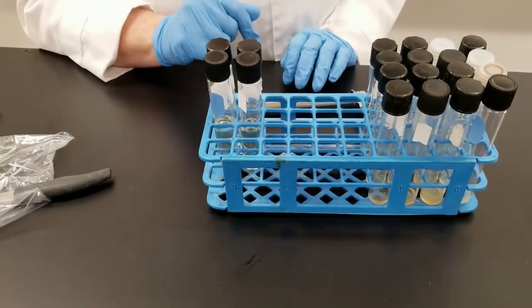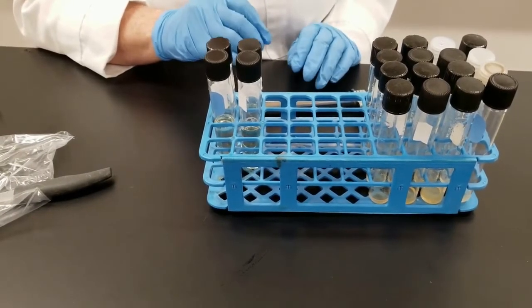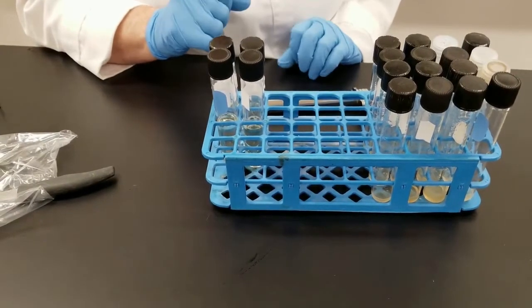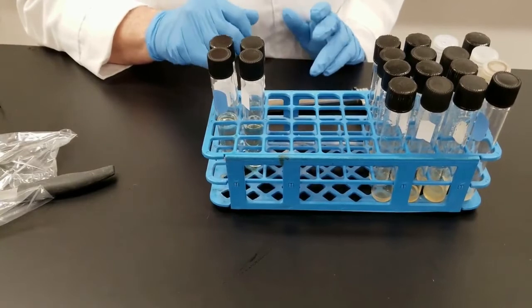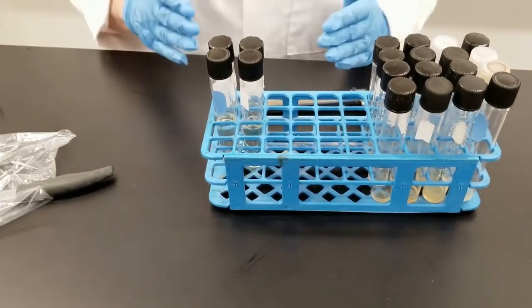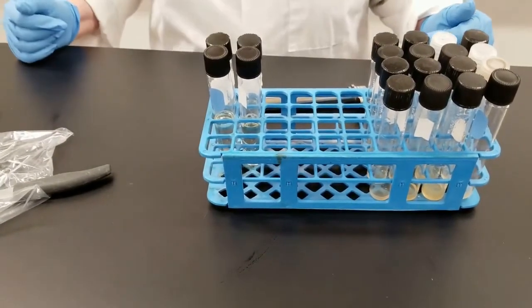They prefer media in a pH range from about 5.5 to 6.5, so you have to drop the pH down a bit. So you're going to use a little bit different media for that. That will inhibit the bacteria from growing, so that it's selective from that standpoint of what pH you have. Are you looking to grow bacteria? You're looking to grow the fungi.